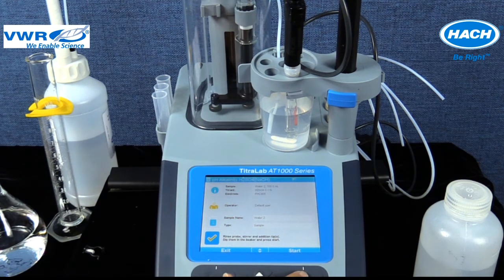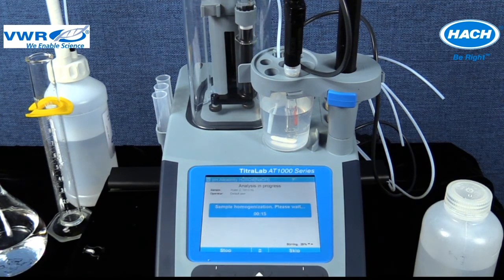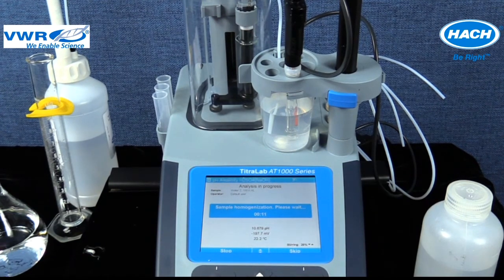When the sample beaker is in place, the start key on the method screen can be selected to start the titration. The software will display that the analysis is in progress and then that the sample is being homogenized for 15 seconds. During this step, the sample is being stirred.